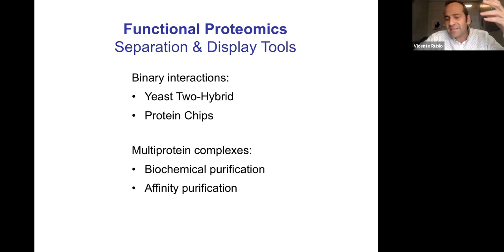In specific cases these can involve additional proteins, and of course we know yeast three-hybrid systems that allow detection of interaction of trimeric complexes.